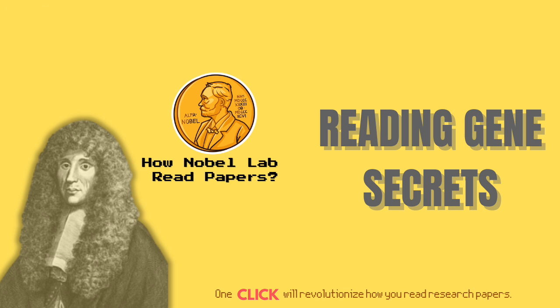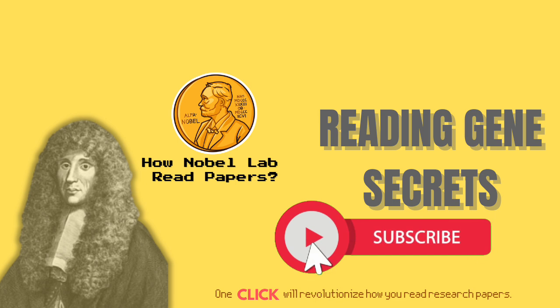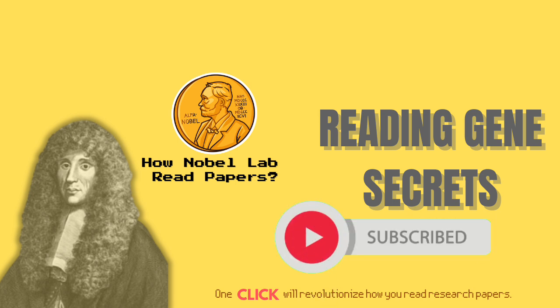Oh, yeah. Like what were the main headaches for researchers then? Well, first off, microarrays had a pretty narrow dynamic range. That means they weren't great at accurately measuring transcripts that were really rare, or the ones that were super abundant. It was tough to get good numbers across the board. So hearing a whisper and a shout with the same mic, tricky. Exactly. And they also suffered from cross-hybridization. Similar gene versions, isoforms, could stick to the wrong probes, blurring the picture. That's a big problem if you need precision.